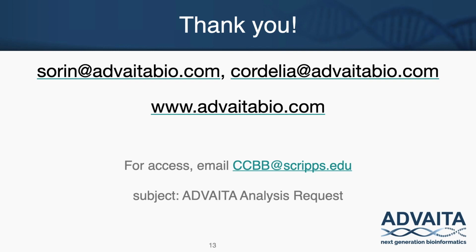So Cordelia, correct me if I'm wrong. When you upload the data to Advaita, we use certain cutoffs on log fold change and adjusted p-value. Once those numbers are set in, when we share the results with any of the researchers, they are not able to change that. That's right, by themselves. So if you request a different cutoff on these two parameters, then we have to re-upload the data and it'll be a separate analysis again.